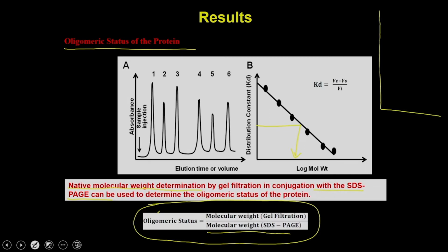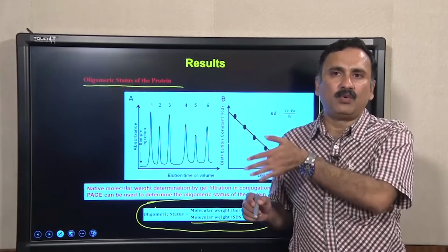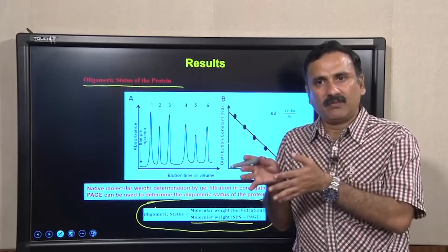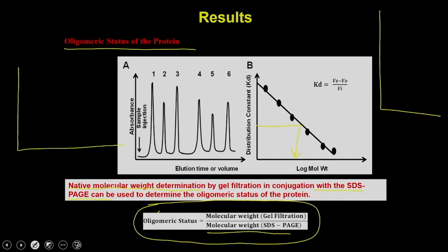Apart from that, quality testing can also be done when you analyze protein X on the gel filtration column. What you are going to get is the pattern of protein X in that particular buffer condition. You can imagine that protein X either gives you a single peak, or in different conditions protein X might give you 2 peaks.